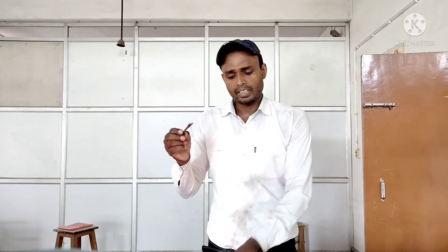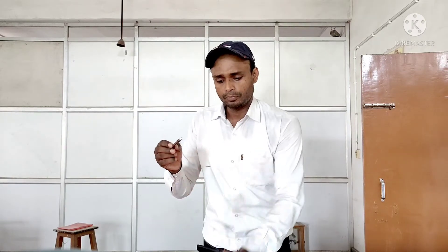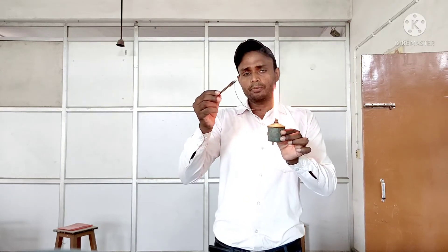Bring the tip near the candle flame, like this. We bring the tip of the ribbon near the candle flame.